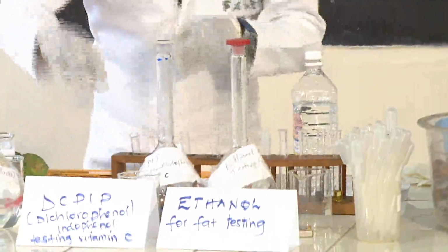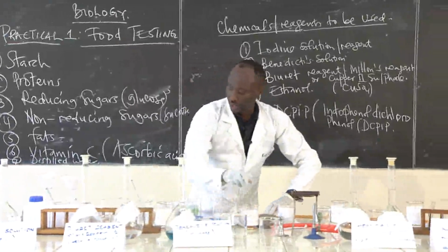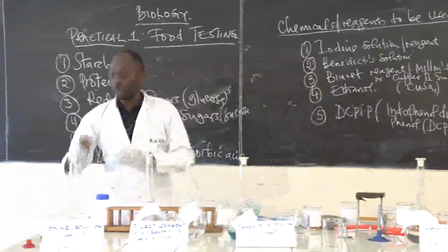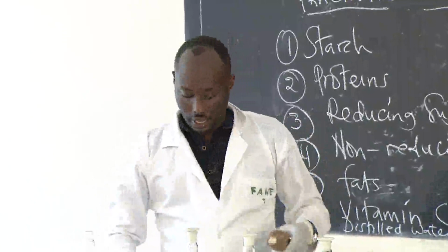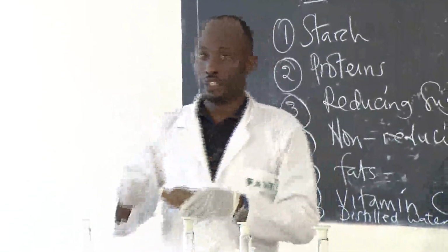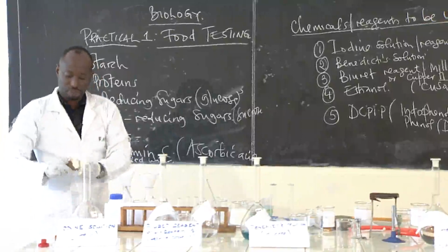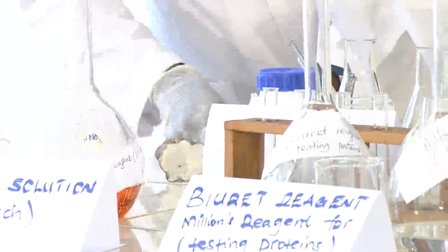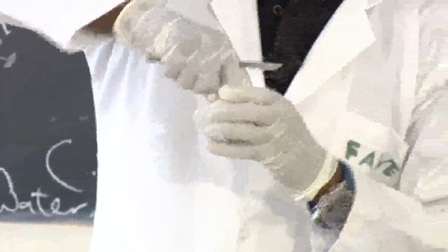Okay. Now, we are going to test the presence of starch in this food. Will it contain starch? I will use my knife. I extract a small piece of it and put it into a mortar and pestle. I try to crush it to see if we have the same results.